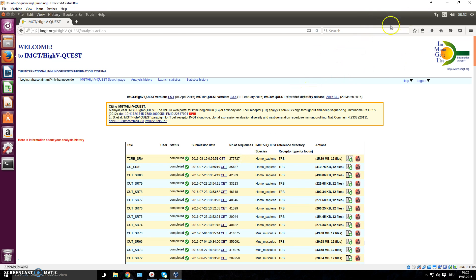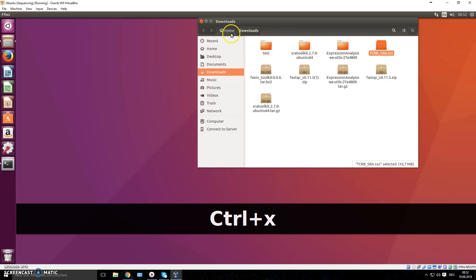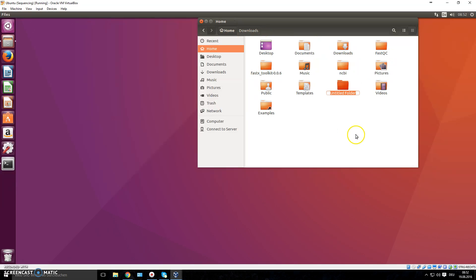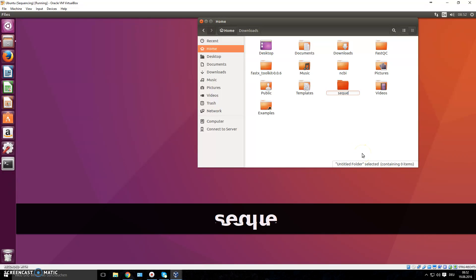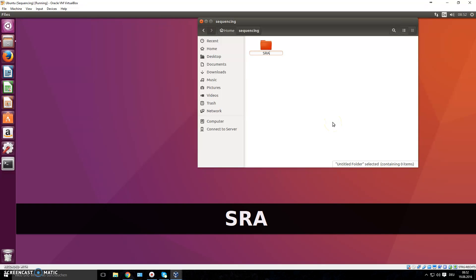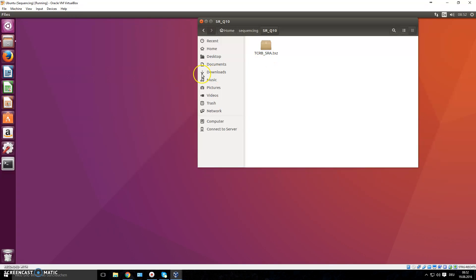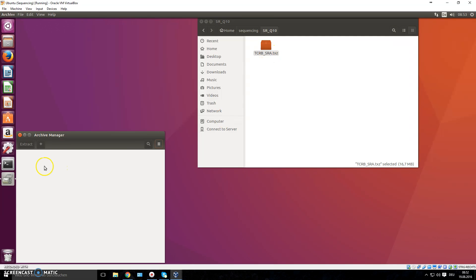We can open it up and have a look. Let's make a folder that we call 'sequencing' and we'll have subfolders here for these sequences. I just cut it from the downloads folder and pasted it right here. You can unzip a file with the terminal, or you can also just double-click it.